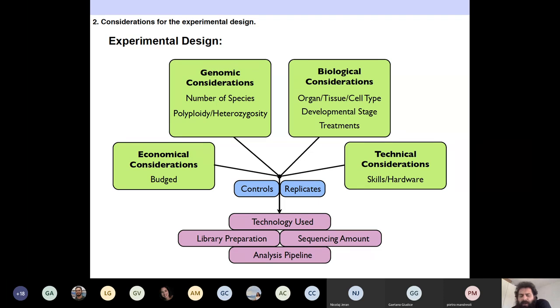So at some point, I thought, come on, but this is a Solanum, so maybe it's an octoploid. But it doesn't ring a bell that it's an octoploid. So I contacted these guys and said, what did you send me? They said, we sent you the samples of this Solanum dulcamara. I said, perfect. Do you know if your species is a polyploid? They said, no, it's a diploid. Okay, so why do I have 16 alleles on average per gene, sometimes even more? They said, well, that is probably because we mixed different accessions.